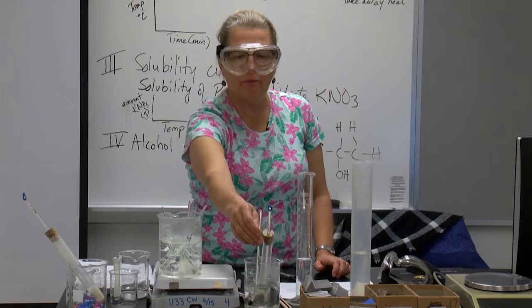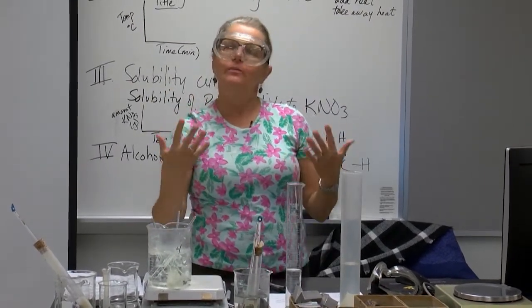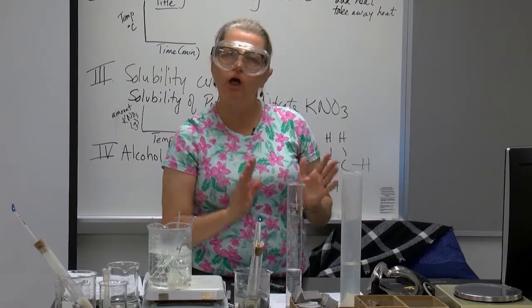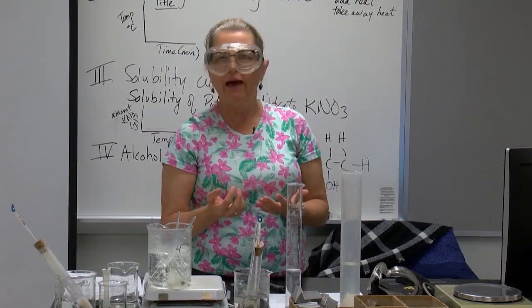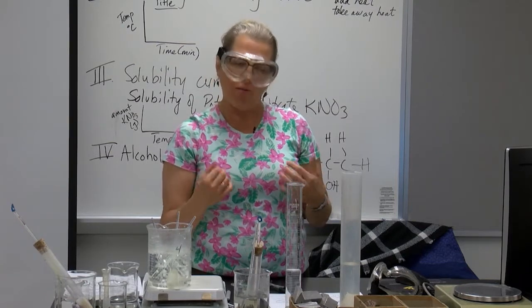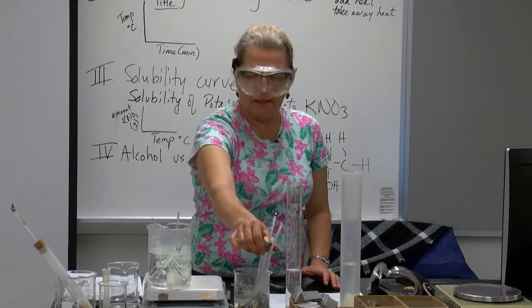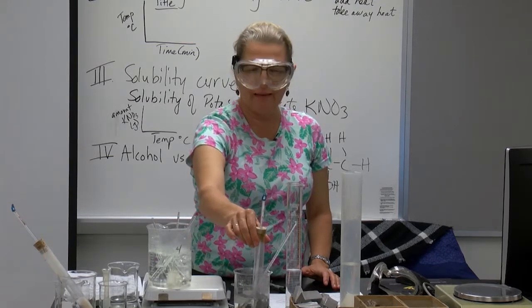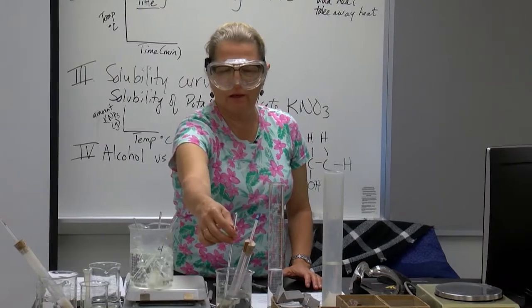And we're going to take readings for 30 minutes. As we take the readings, we're going to note in the test tube how much solid we have and how much is still liquid. Right now, in our first reading, it's 100% liquid. And the water, of course, is also liquid.